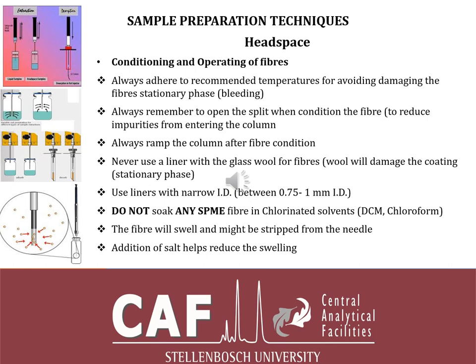As mentioned earlier when I was talking about SPE, it is also important with SPME to condition the fiber before using it. Because if one does not condition it, when you run on the GC you might see peaks, especially if you've got an FID, and you think maybe it's a peak from the compounds, especially if you're working with unknowns, only to find that it's coming from the bleeding of the stationary phase of the fiber. So it is important to condition the fiber before using it. And when one purchases the SPME, in the box in which they are inserted, there's also information on how to condition and precondition the fiber, and what to do and what not to do.